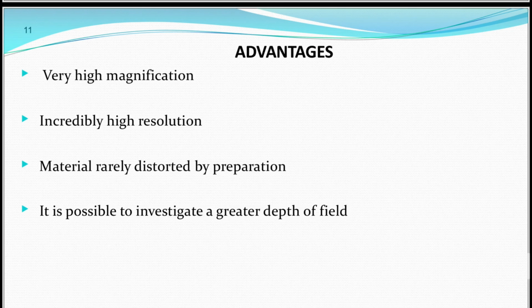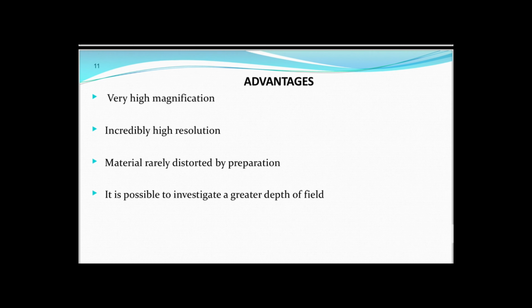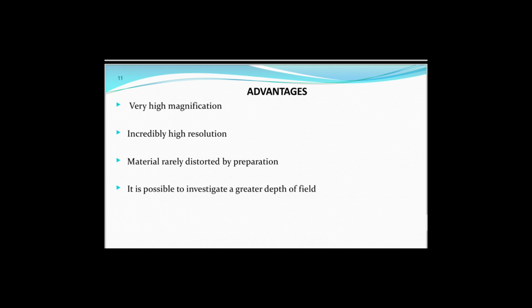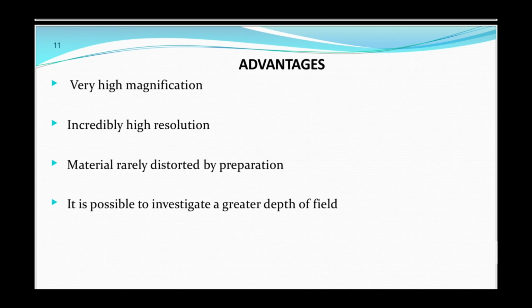What are the advantages? They have very high magnification, incredibly high resolution as well, and the material is barely distorted by preparation. Then it is possible to investigate a greater depth of field.